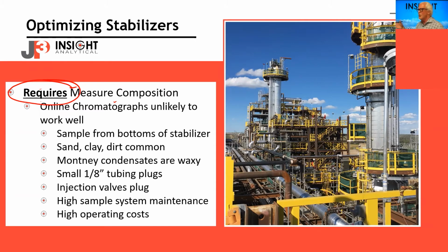Online chromatographs are used in a lot of applications, and often they work great in some applications. This is one where online chromatographs, especially on plant condensates, can be really difficult to get working.